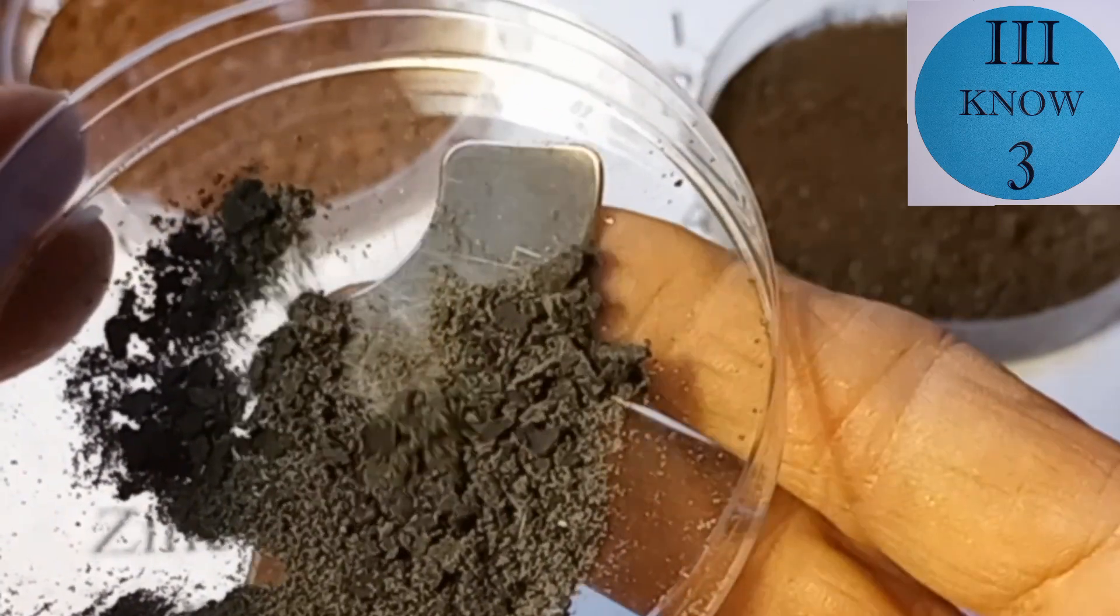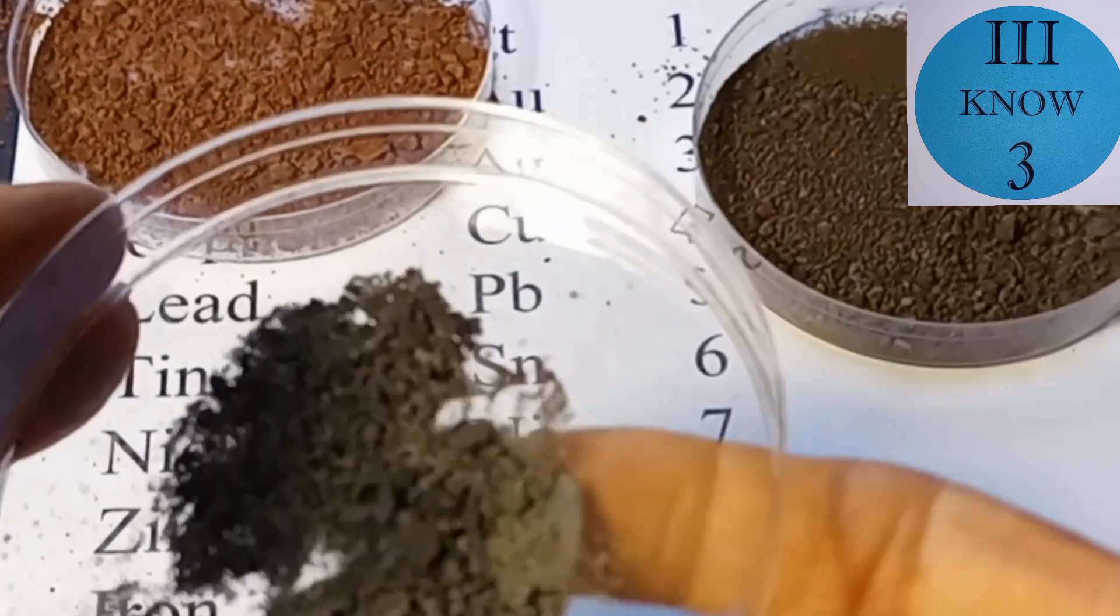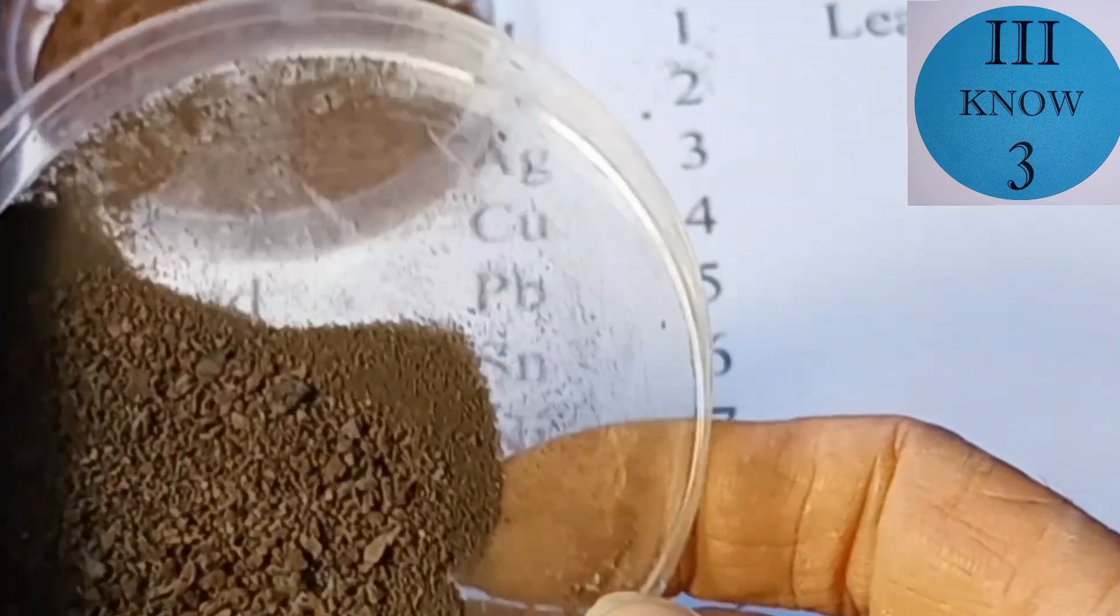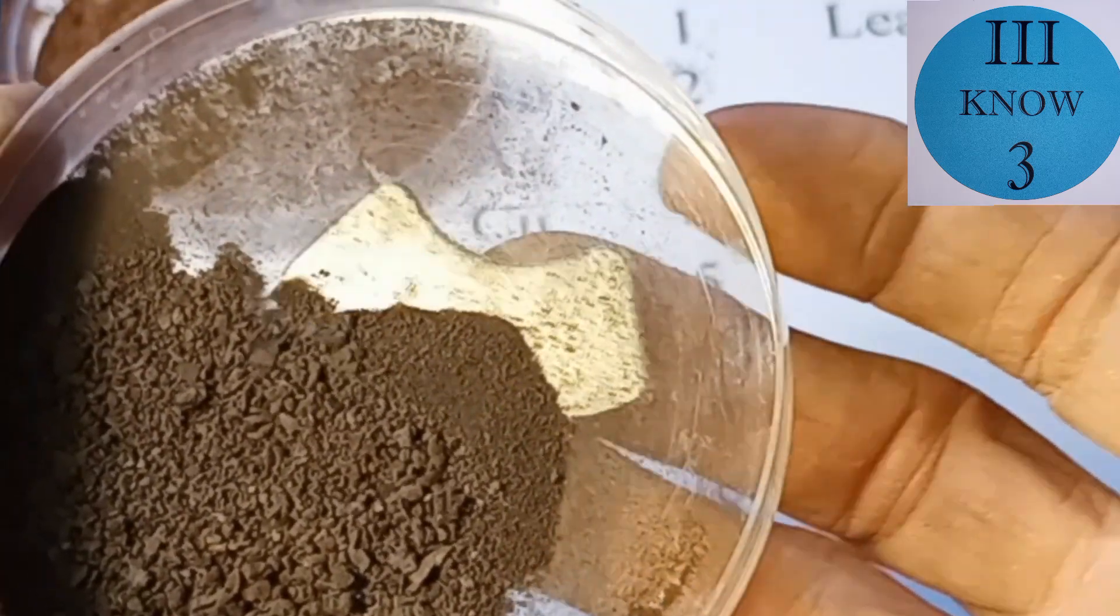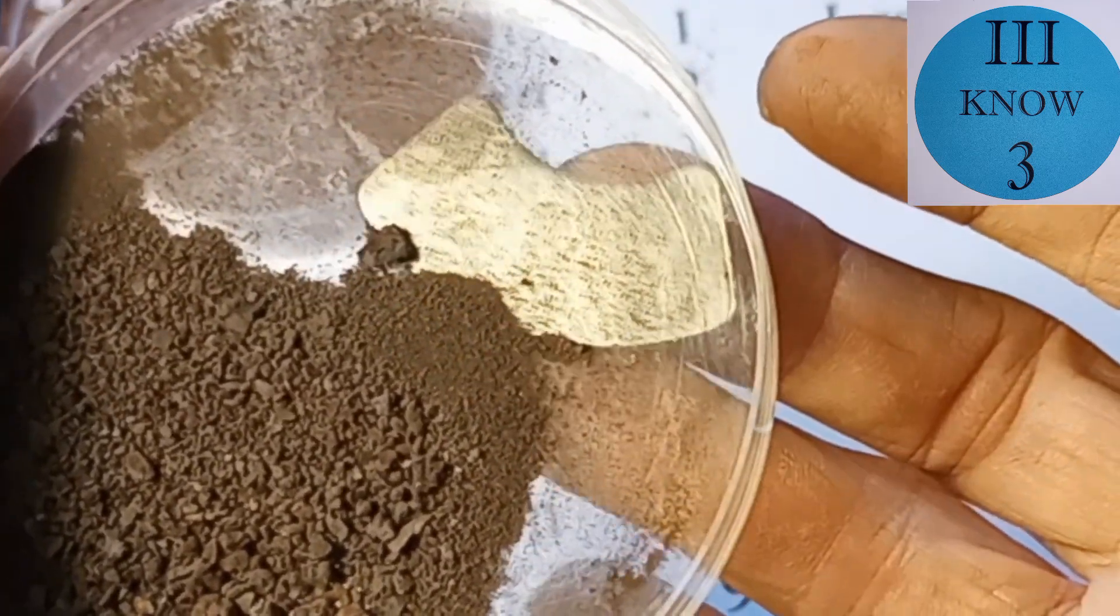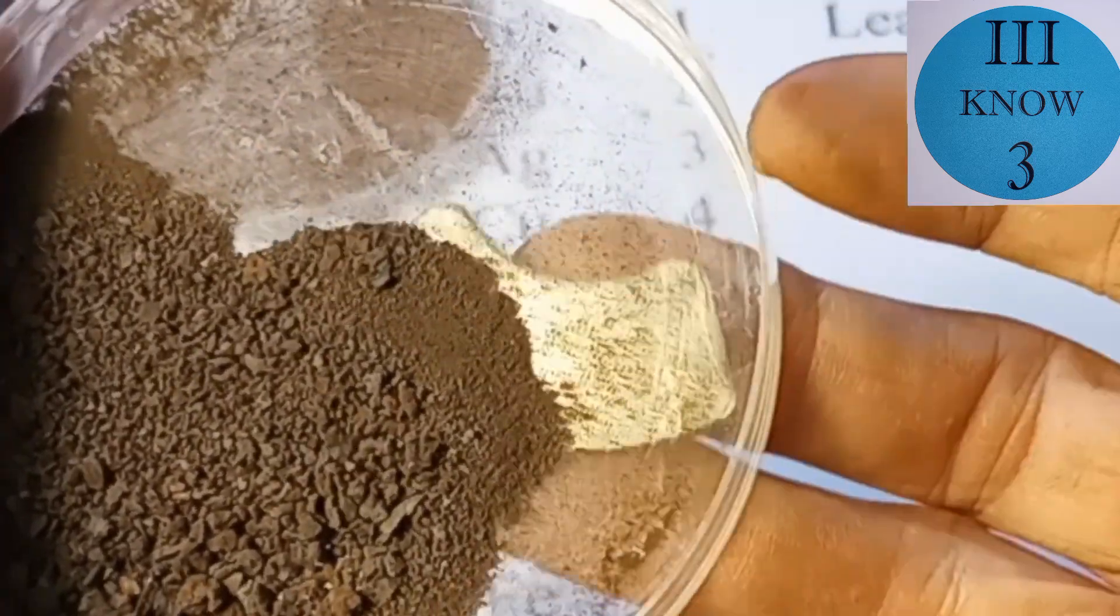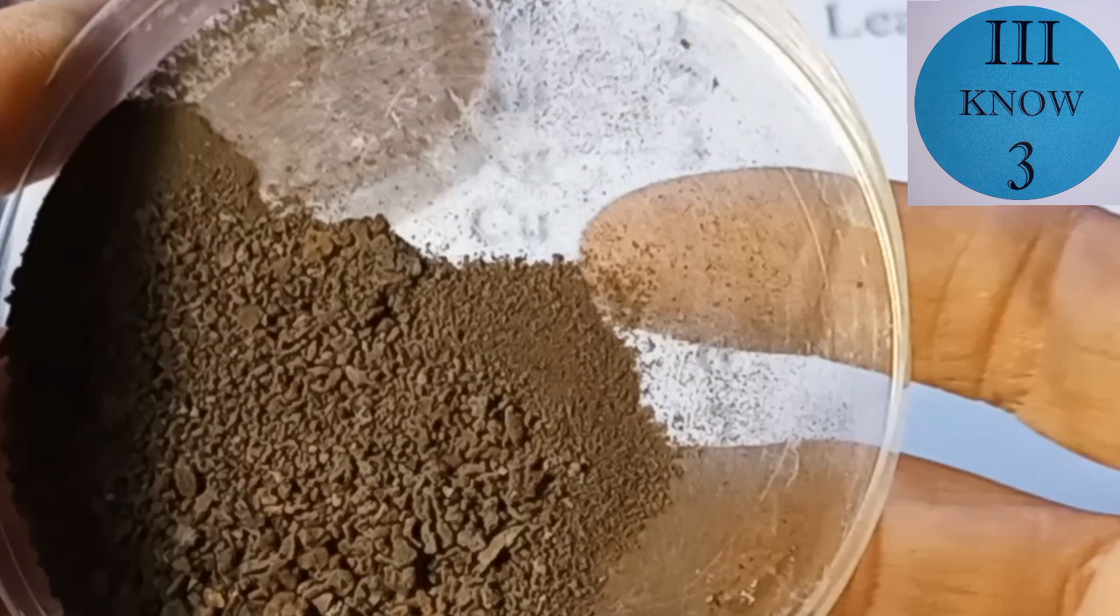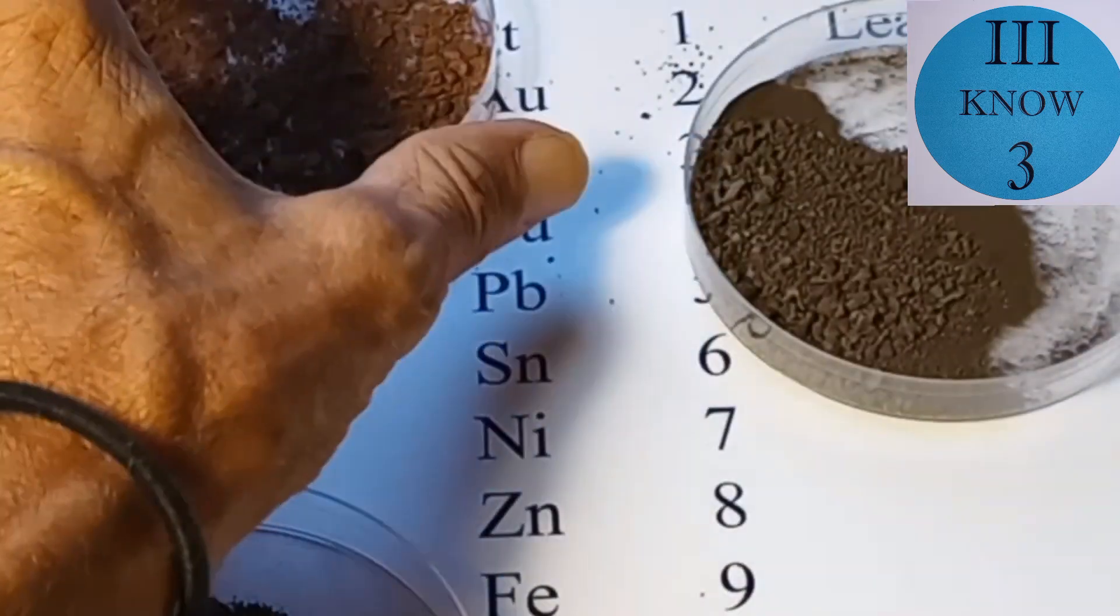This next sample is what precipitated out after the original copper was removed and although you can see it looks like copper you can also tell there's some nickel in it because some of it is following the magnet around.